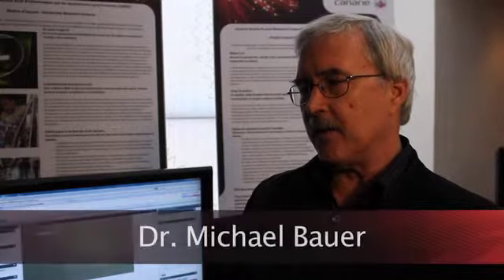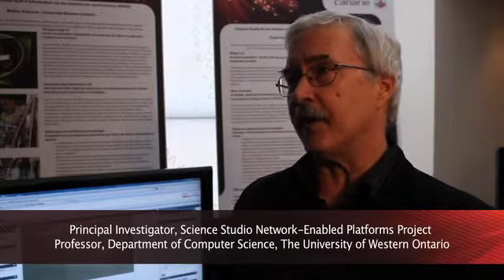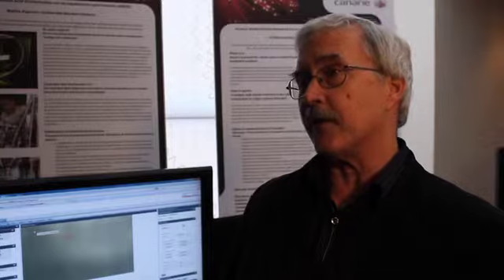Is the setup just in Canada, or are there international facilities and partners? Actually, more recently, well, first of all, one of the advantages is browser access. You can have team members that are international. The other thing we've recently done is made contact with interested groups in both Brazil and Australia. They also have a similar geographic problem. They also each have a single synchrotron. So one of the interests coming out of those is that they are very interested in Science Studio. Brazil is already committed to using it, so they're going to be adapting the software for their own environment, again, to provide remote access to beam lines at the Brazilian synchrotron. So this opens up a lot of opportunities for collaboration in a variety of circumstances where researchers around the world can now access instruments no matter where they are, and analyze the data in different locations, and enhance the collaboration across the entire scientific community.